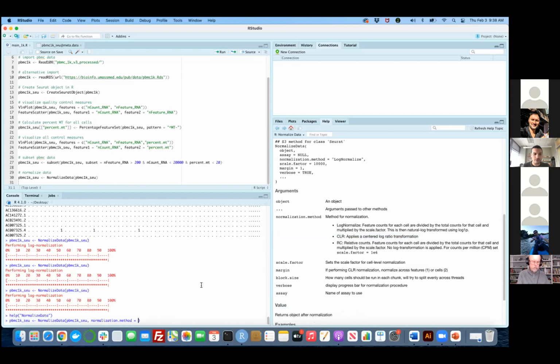So you just click on it and you can define the parameter yourself, like it's shown in the help page over here, but we don't really need it now. The default version is okay.